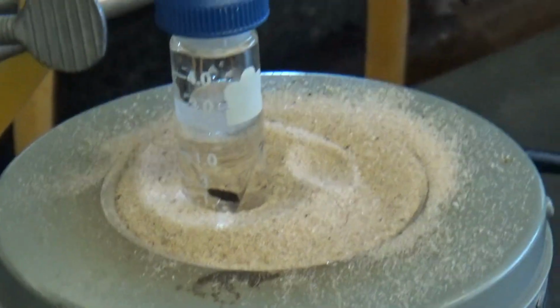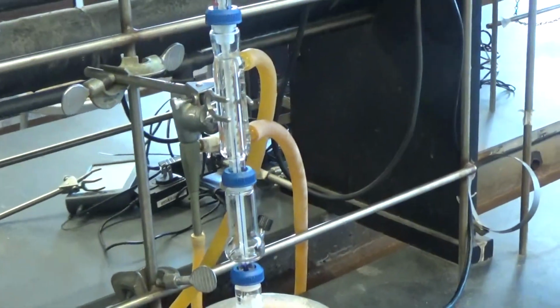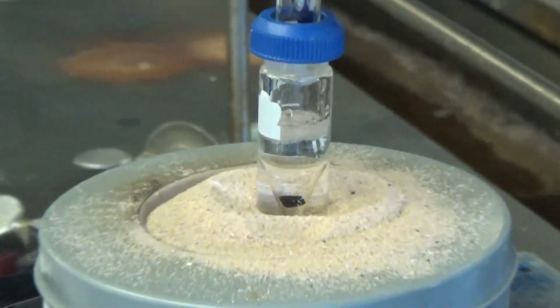All right, so now we wait a while. And the boiling chip will just prevent out of control boiling. So it's cooking a bit, and we can actually see the motion of the fluids. A little bit of boiling actually too. That's pretty cool. This is the reaction going. You can see the boiling chip jumping around. And that's going to prevent the boiling from going wild, and with a high temperature, the pinacol will dissolve.